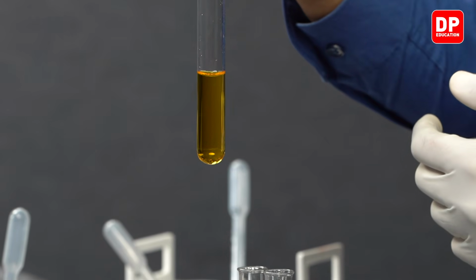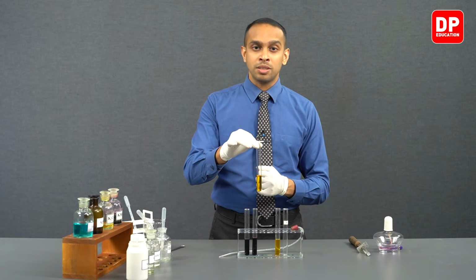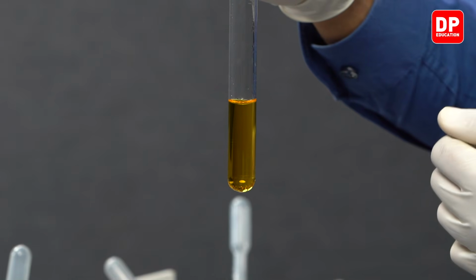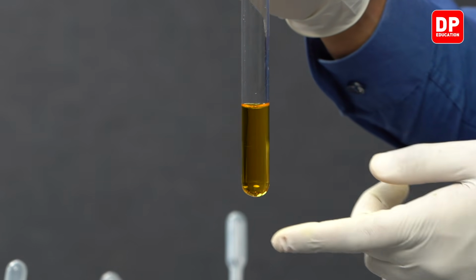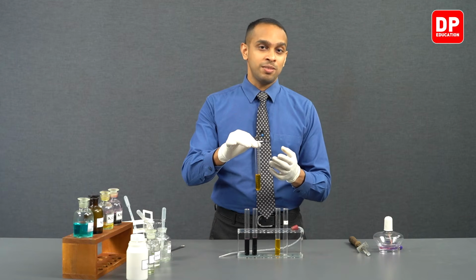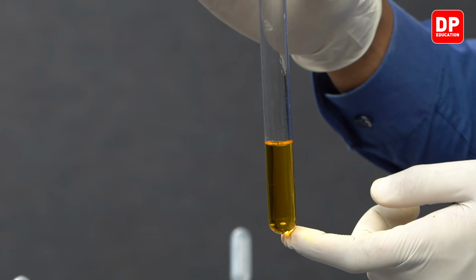So you will be forming a very cloudy suspension that is a mix of chromium 3 plus green color solution, and the colloidal sulfur that is formed here will be present in the aqueous medium dispersed, which will cause the solution to be a bit more unclear and will have a little green color to it as well due to the formation of chromium 3 plus ions here.